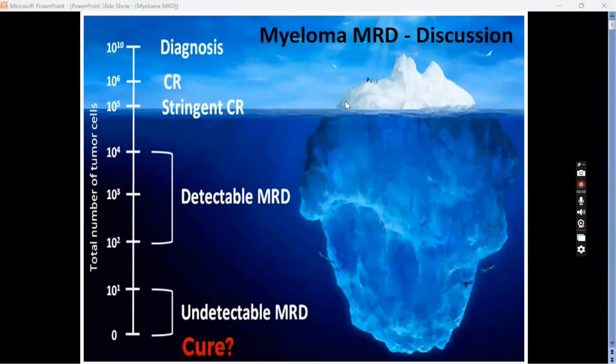Right, very good evening, and welcome to the penultimate session of our advanced flow cytometry course. Today we'll discuss myeloma MRD. The plan is to quickly discuss myeloma MRD and cover a bit of sensitivity. What is sensitivity in event acquisition, especially in MRD? What is limit of blank, limit of detection, and lower limit of quantification? I can give you an idea of those things today.